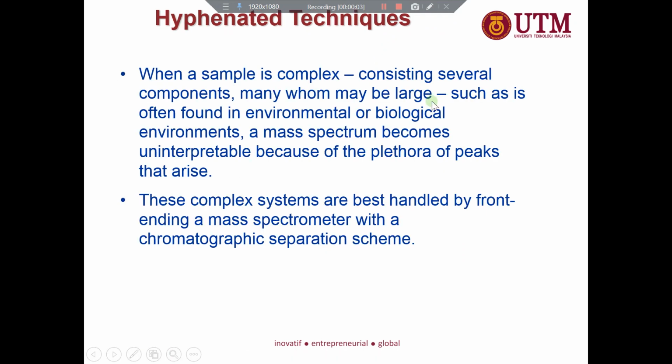the next one we go to is the hyphenated technique. Hyphenated technique means we combine one technique with another technique to get a better result. We use hyphenated techniques when we obtain a sample that is actually complex. For example, if you run only on the GC-ECD or the GC-FID, you obtain a gigantic amount of peaks.